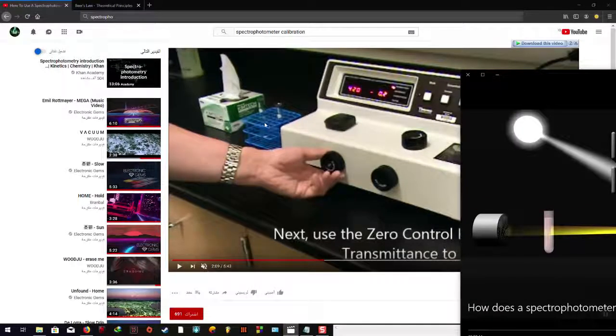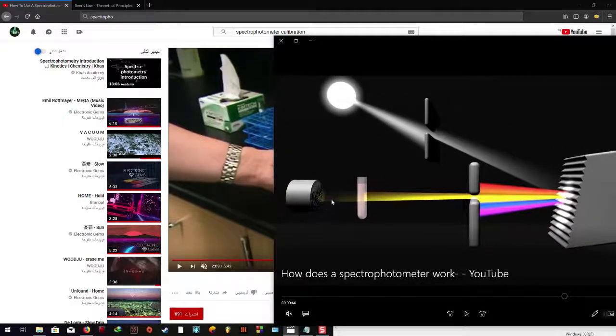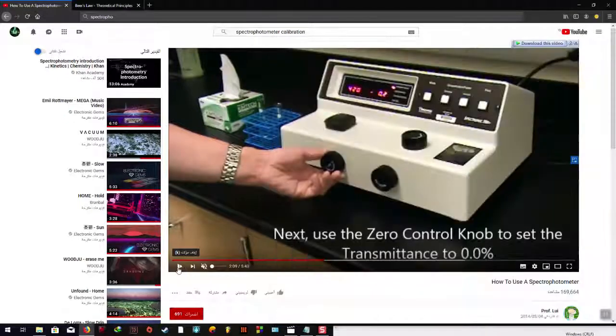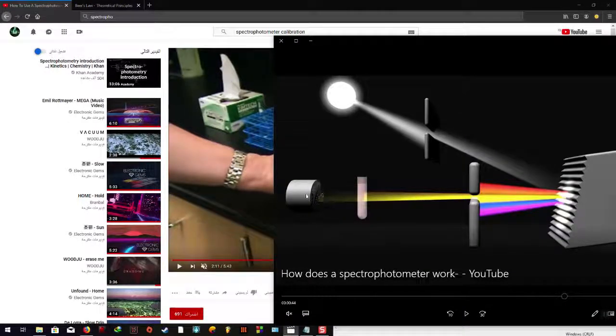But at the same time, some light could reflect or pass through, or there's invisible light, lower or higher than the visible nanometer range. For example, X-ray, gamma, or ultraviolet could reach the chamber, piercing through the walls into the chamber here. So we are going to tell the detector to ignore that light. Any light other than the beam will be ignored, any radiation. So when we adjust it to 0, it will consider there's no light, that it's completely dark here. Any light that comes, it will consider as 0.